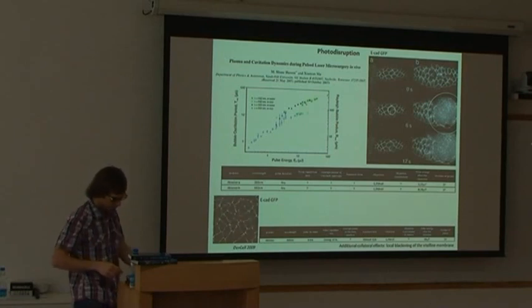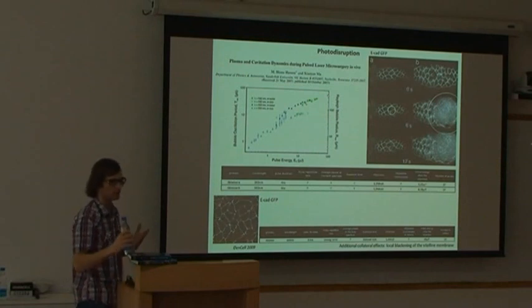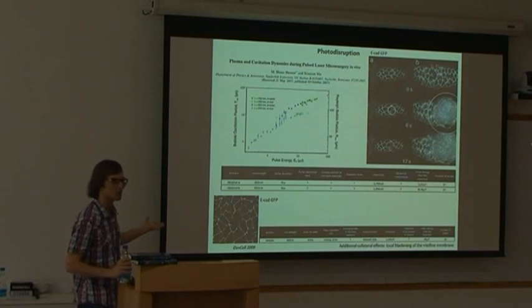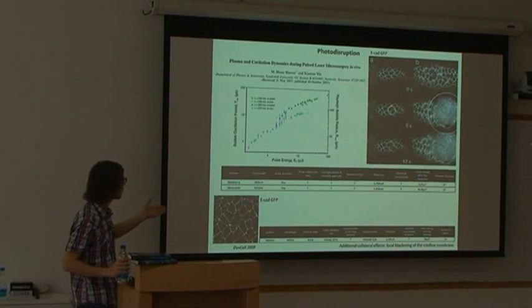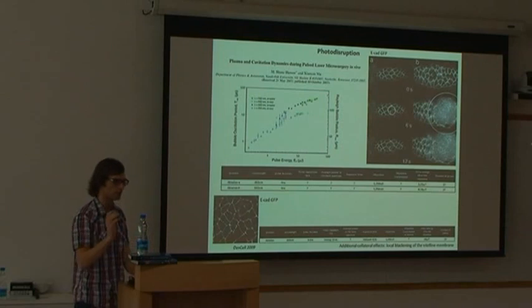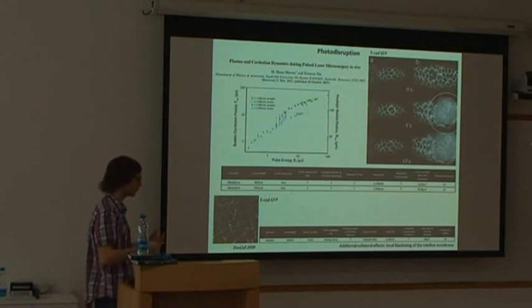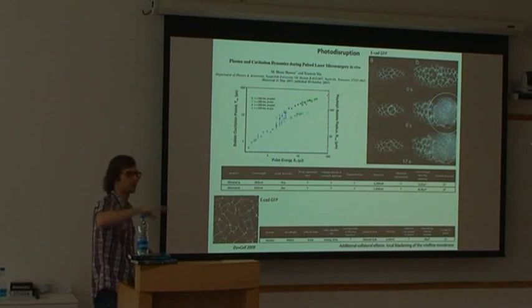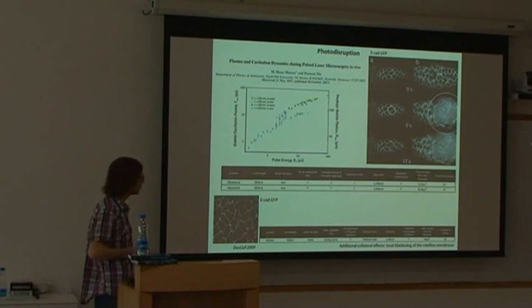Yeah, so yes, I can agree in the sense that by looking just by eye, I feel already that this experiment needs controls. I feel that there's also much extra damage. And they also specify in the paper, though I don't want to talk too much about this, that there are additional collateral effects: local bleaching, blackening of the vitelline membrane. So definitely there's much effect, not only on the plane.